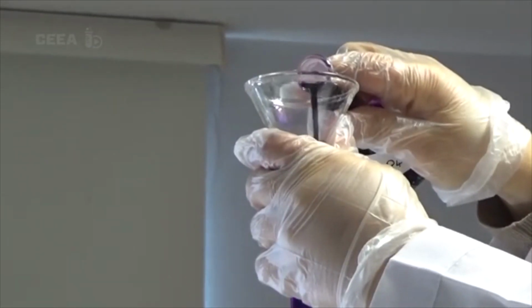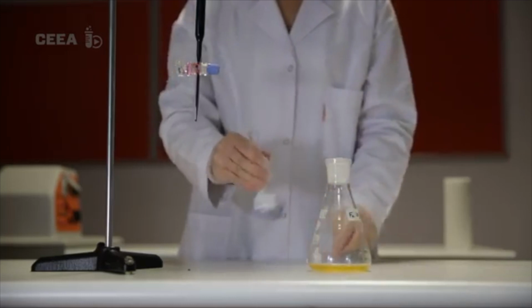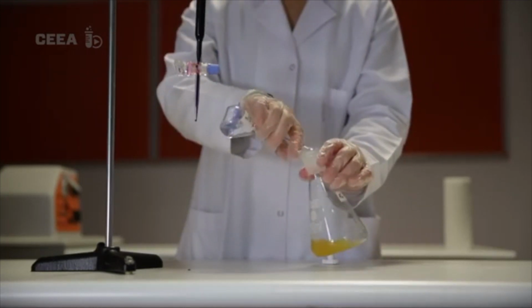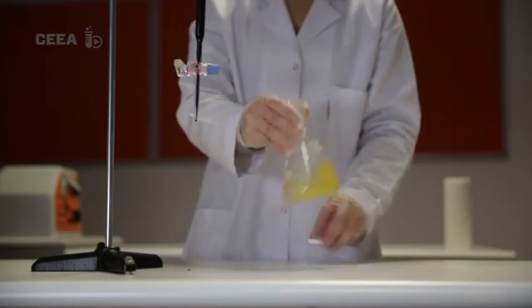Now this video, courtesy of the CEEA YouTube channel, shows a potassium permanganate Fe2+ titration taking place. Here you can see we're adding the sulfuric acid to a sample of the Fe2+, and we're mixing it.